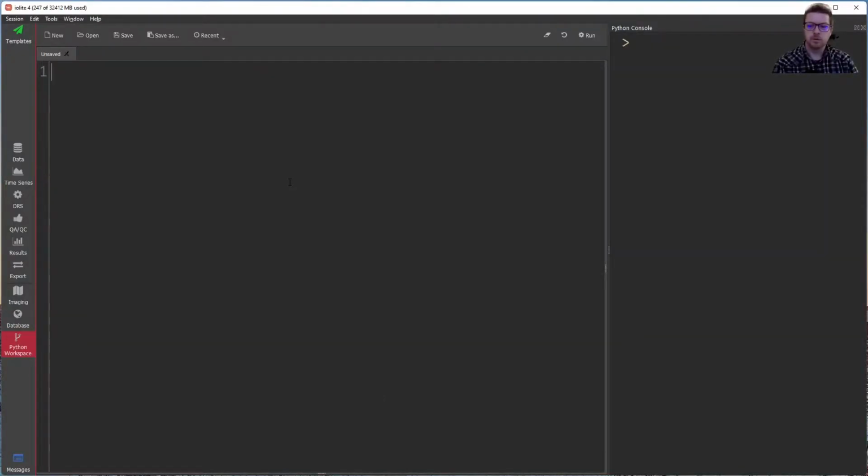Now let's have a look at some of these concepts in action. To start, let's create a blank QWidget. To do that, we need to import QWidget from iolite.QtGui.